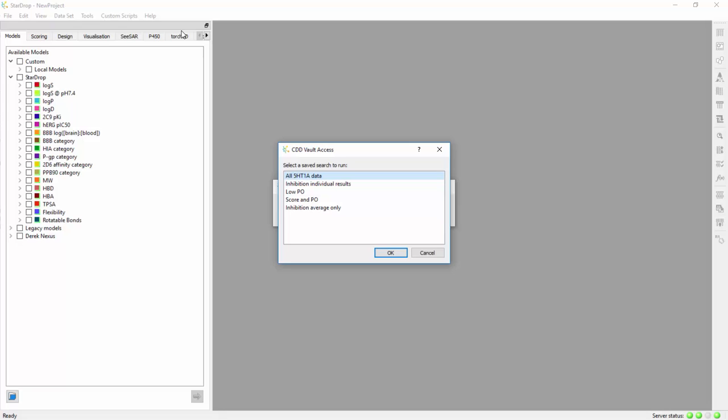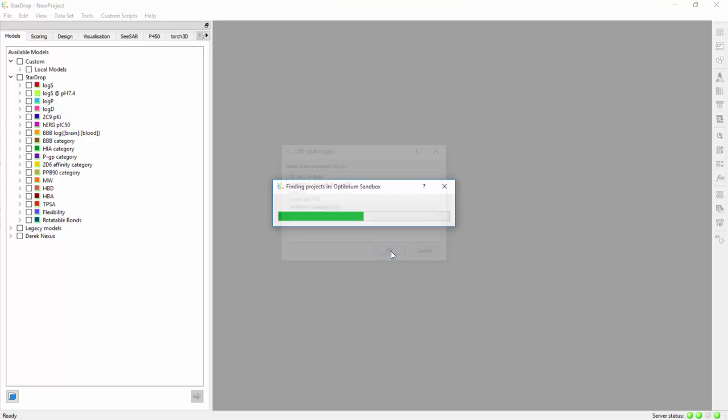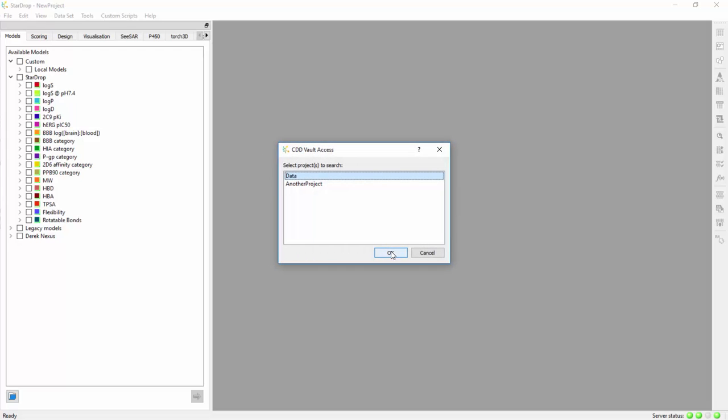If you have access to multiple vaults, you will be asked to choose one first. If there are multiple projects in your vault, you can choose which projects you wish to search over.